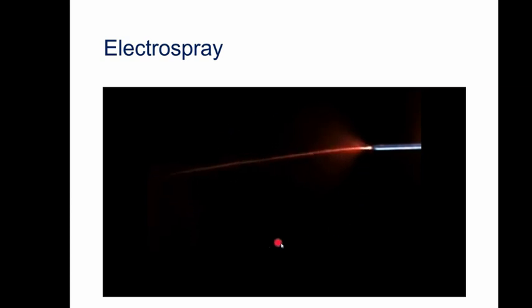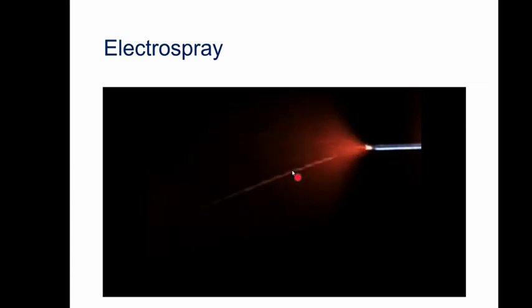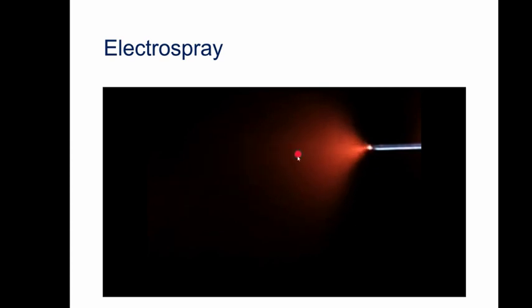And you'll see as the voltage gets higher, we eventually get to the stable electrospray, which you want to give you nice results. But you can see there is some electrospray going on here, but there's also some very large droplets being produced. And there we go, we're getting close to the stage now where the voltage is high enough to be producing a stable electrospray. And you also notice exactly how wide the angle of this spray is, and how finely divided and evenly distributed the spray is.